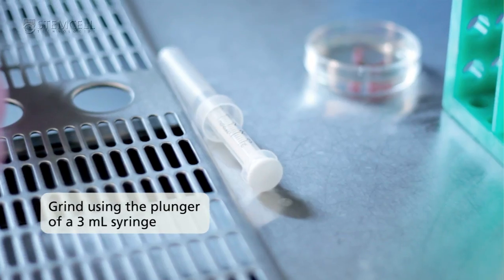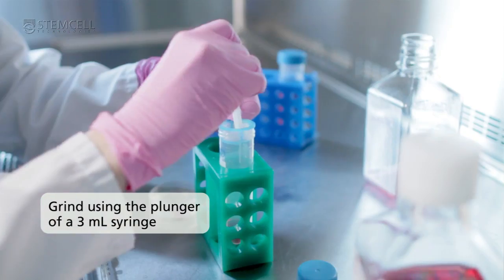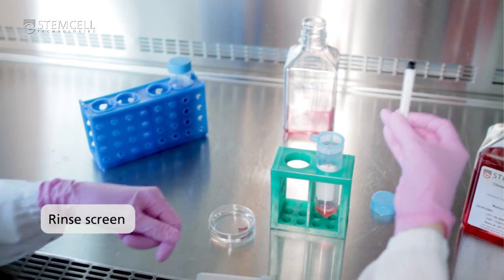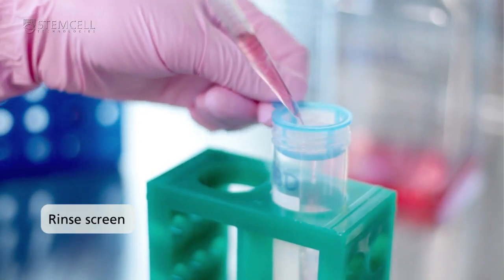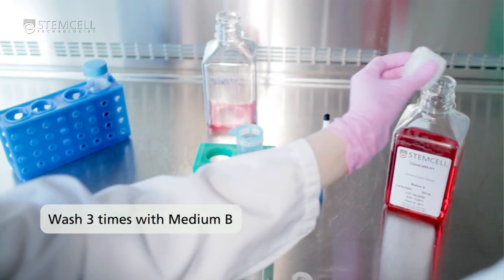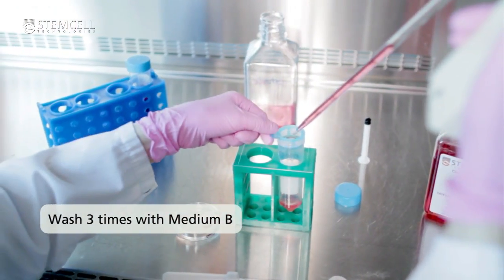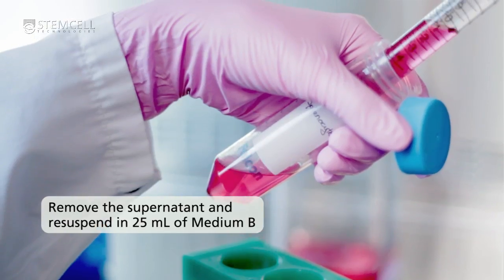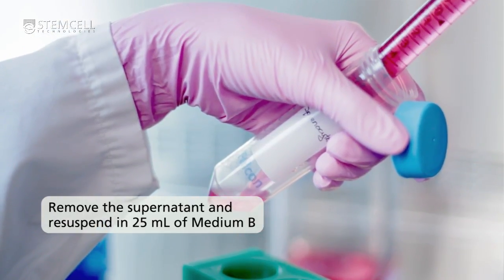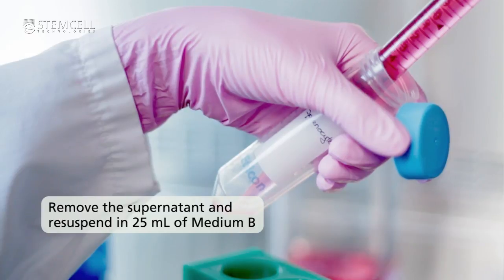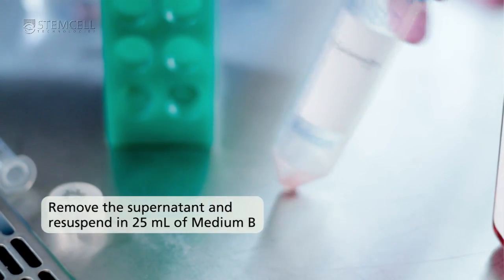Grind the spleen using the plunger of a 3 mil syringe. Rinse the screen to flush all the splenocytes through the mesh and into the conical tube. Wash splenocytes three times in medium B. Remove the supernatant by pipette instead of pouring it off as the cell pellet is fairly loose. Re-suspend in 25 mils of medium B.